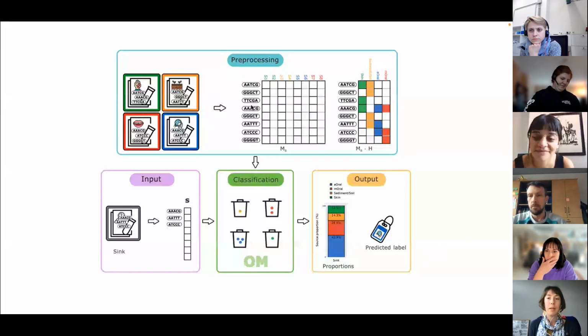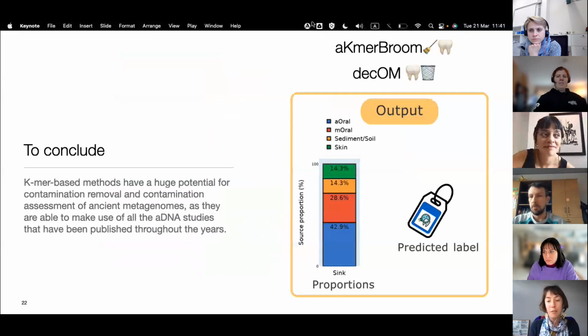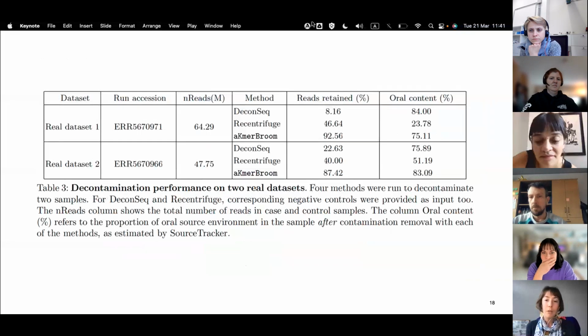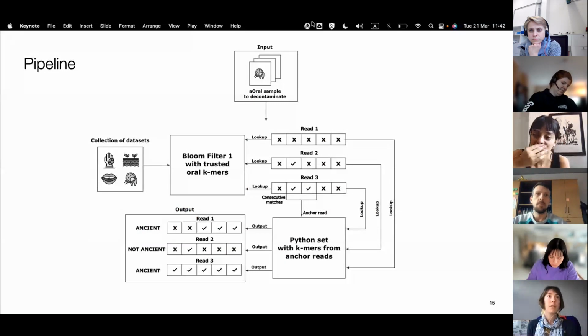This is really useful. And I actually have a question about the k-mer-broom aspect of it, because I know we've talked a lot about this in other SPAAMtish discussions. So I wanted to ask, what actually is the advantage of taking out contamination at the read level over taking it out in a taxonomic table, say? Does it benefit us more than just doing it at the taxonomic level?